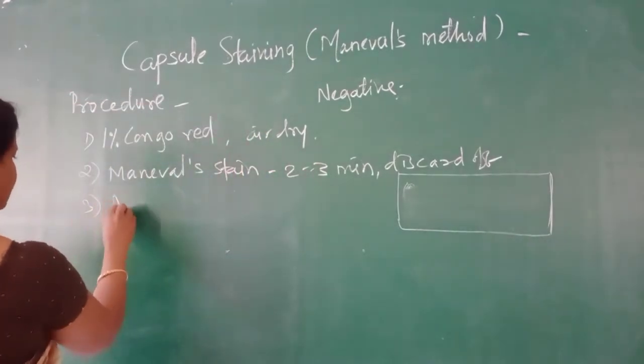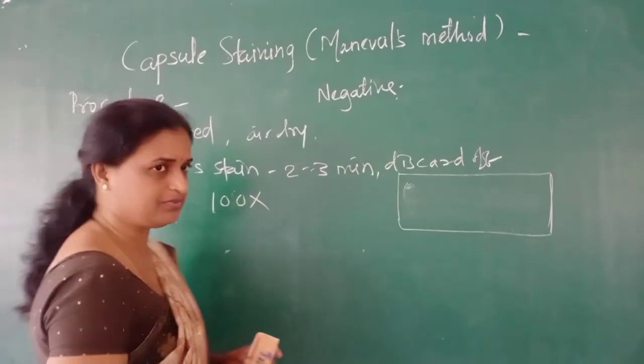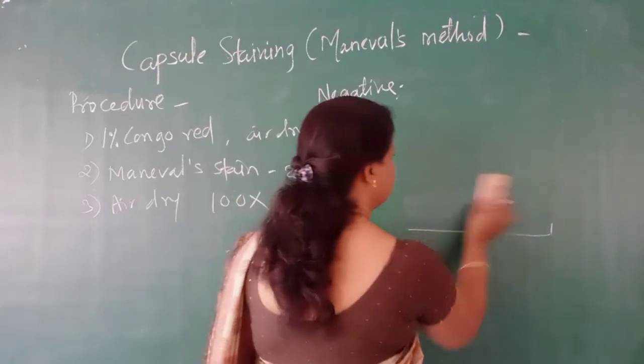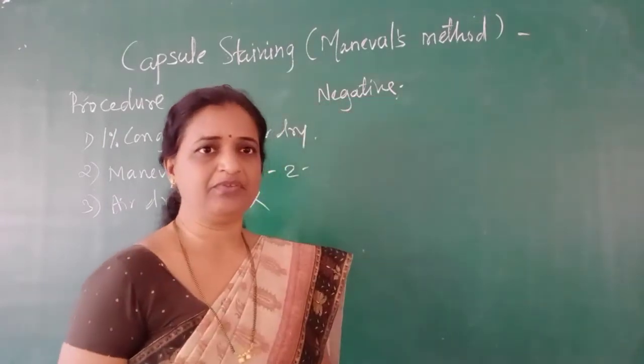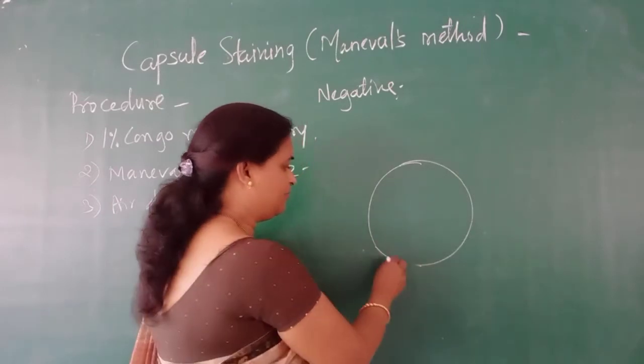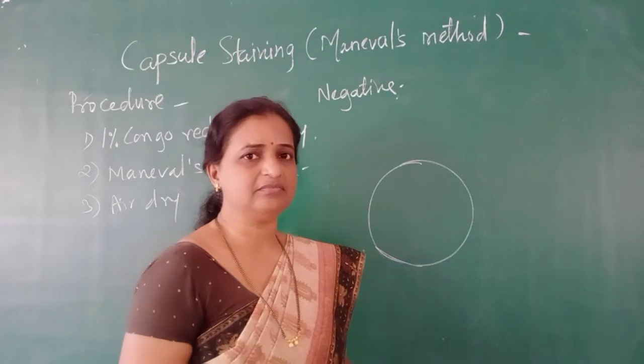After complete air drying, observe the slide under the 100X oil immersion objective. That is a simple 2-step procedure for Maneval's method. Now what is the observation? When you observe the slide after Maneval's method under the microscope, this microscopic field shows the capsule.